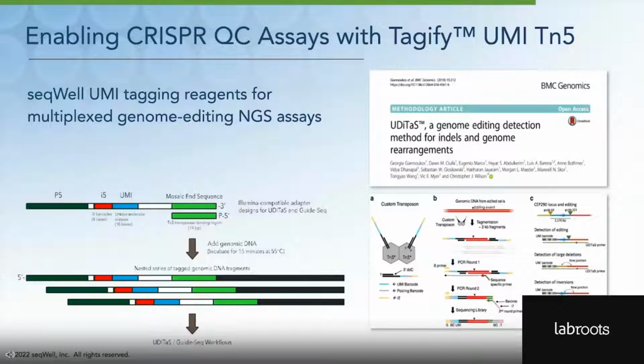Again, there's other ways of doing this. The tried and true way that this field has used for many years is a fragmentation and ligation-based assay. And again, this is a great example where a transposase can come in and take what was previously several distinct steps in a workflow and replace it with a single step that has equally high performance and, again, simpler workflow and more predictable performance.